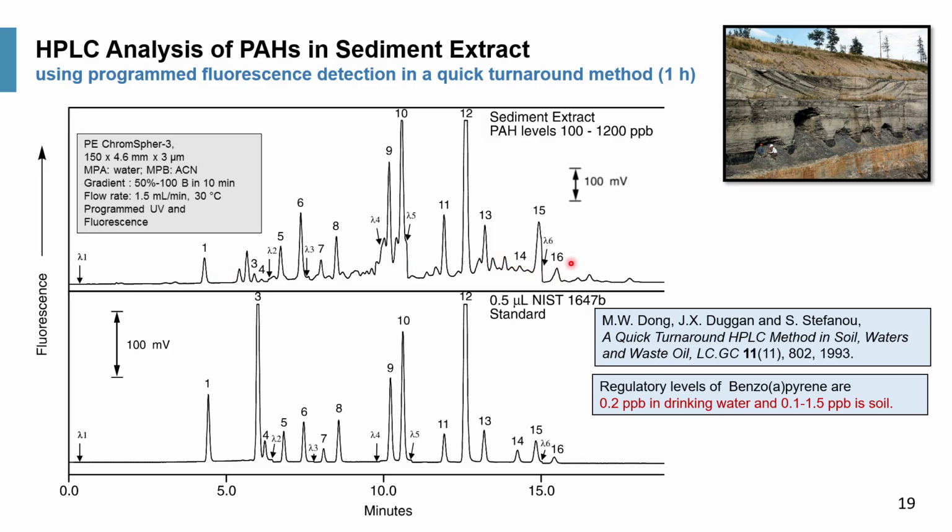You always see the fingerprinting one, right? So the ratio seems to be quite reproducible on all types of PAHs found in environmental samples. You can see a very similar profile between this sample and the air particulate sample.